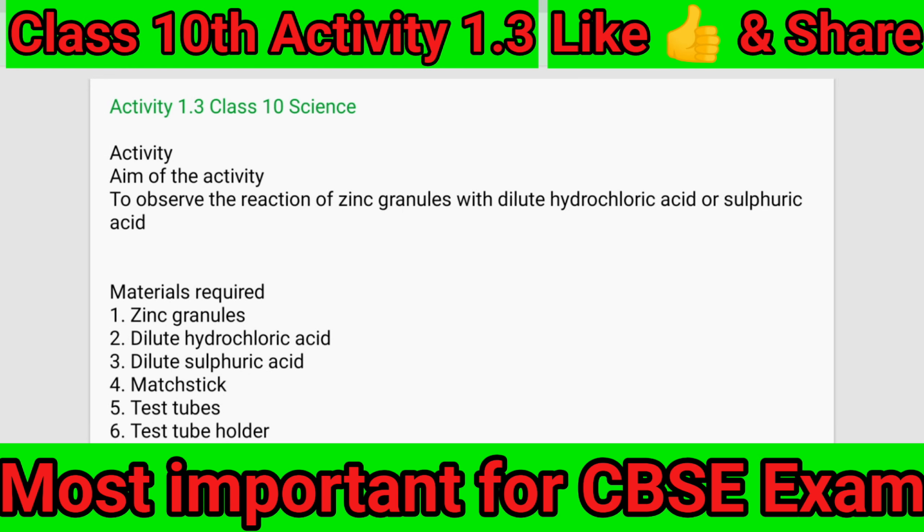Activity 1.3, Class 10 Science. Aim of the activity: to observe the reaction of zinc granules with dilute hydrochloric acid or sulfuric acid.